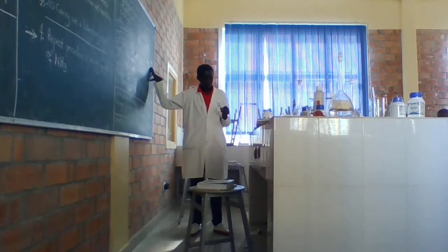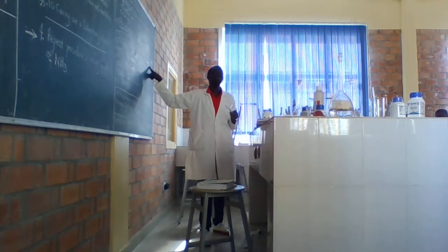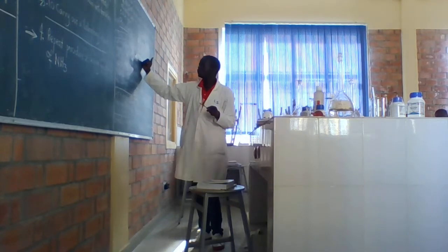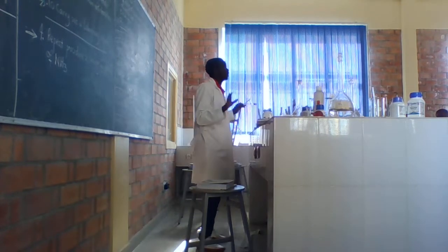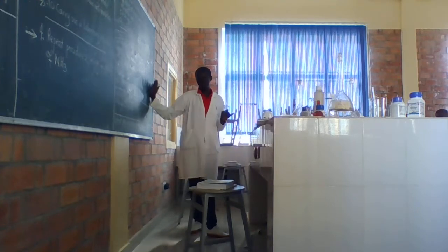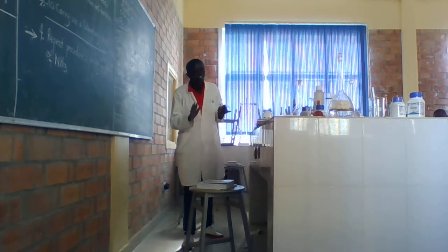Deduction. You write the cation or anion used. The presence of copper, it may be copper, it may be iron, whatever you have, depending on your experiment as observed. And then you let it stand for 1 minute to observe the change if possible.